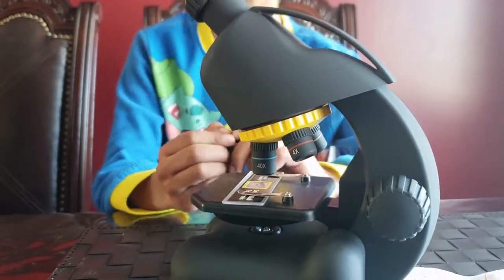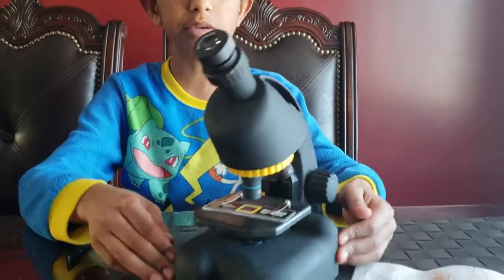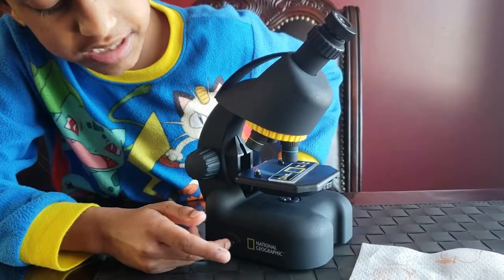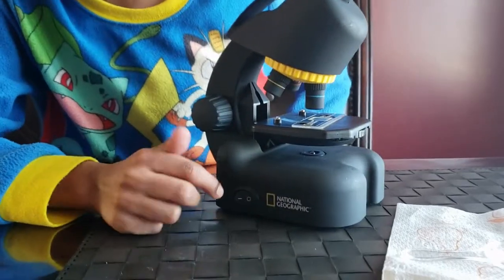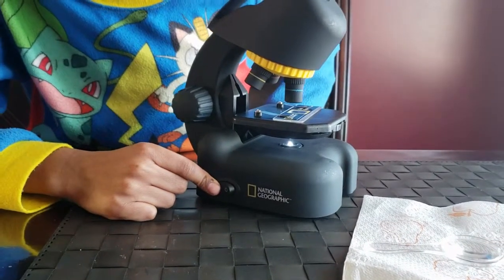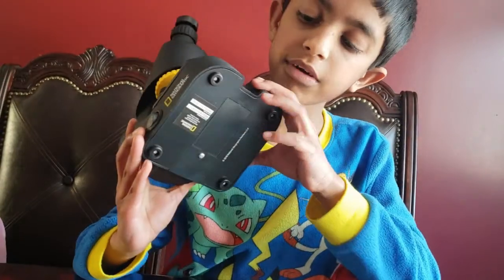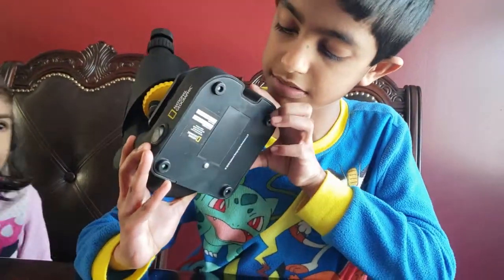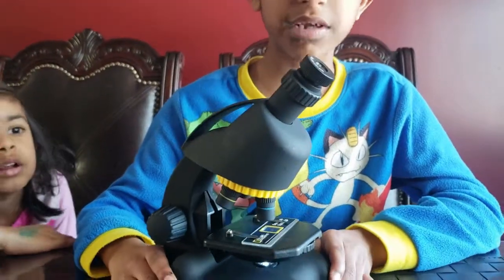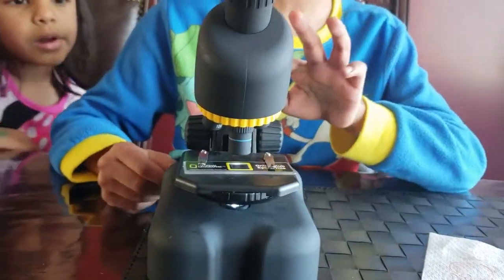Now, we're going to look into the microscope. You need to know where the on switch is. This thing is off. When the light is up, it's off. When the circle is up, it's on. Also, there's batteries in it — down here, there's a compartment with batteries in it. And just to make sure it's on, you can check for this light. If this light's on, the microscope's on.